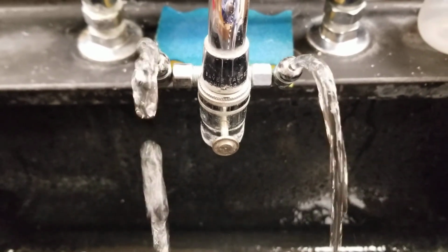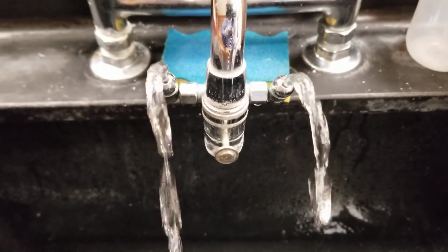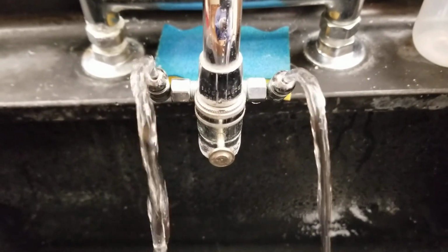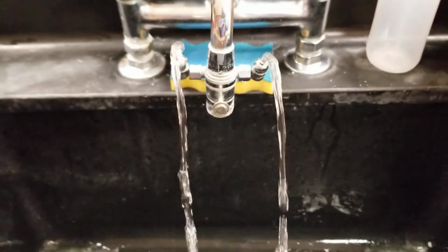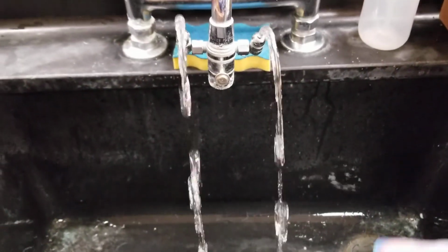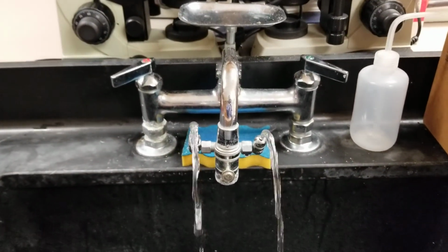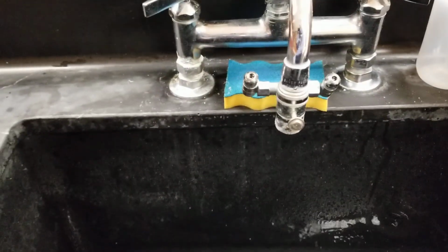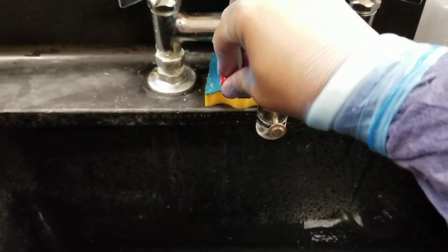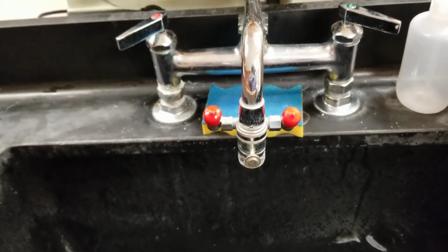Usually we have the students do this to me. This year we have COVID-19 and we have restrictions to that, so we're watching this video, and that ends up getting mainly into the sink, but it does get kind of wet otherwise. All right, so once this is done, you can place these back on here. In an extreme emergency, they might actually pop off with the ejection of water.